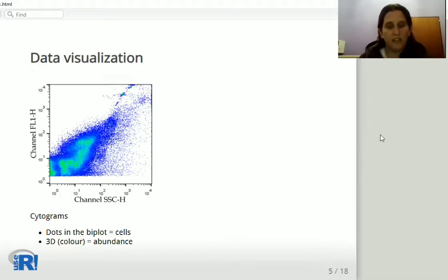Cytometric data can be visualized through cytograms, which are biplots of channels, where dots represent cells and 3D color their abundance.